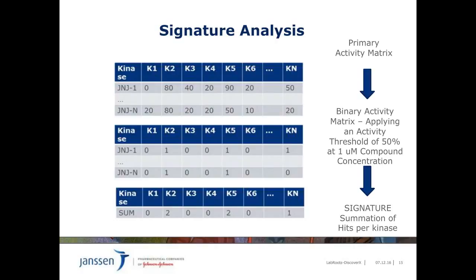We now have in place more sophisticated protocols which analyze the enrichment of the hits versus the baseline of all compounds, including the inactives. The results are comparable but are not shown here.